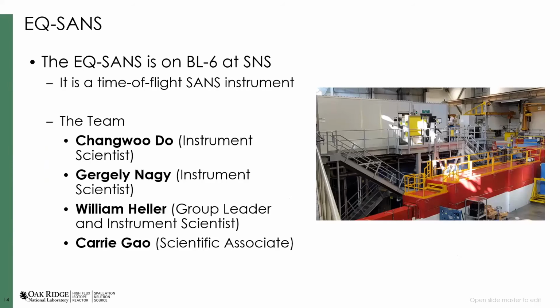So the next instrument is the EQ-SANS at SNS. Unlike the other two instruments that are your traditional pinhole style reactor SANS instruments, the EQ-SANS is a time-of-flight SANS instrument. It is, in appearance, in some sense, very similar to a pinhole SANS at a reactor in that it has a tank with a detector in it that can change distances.